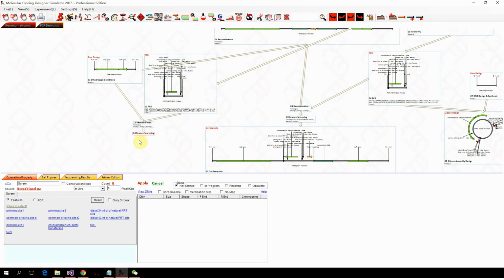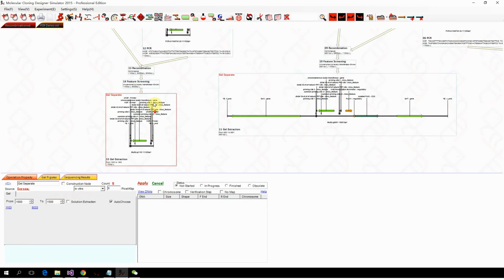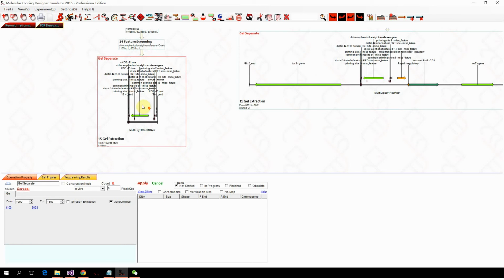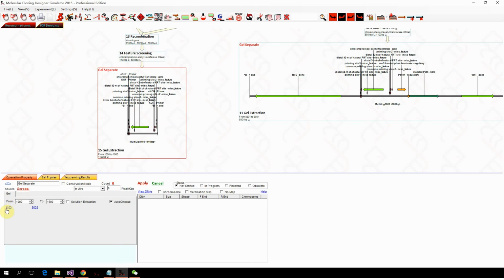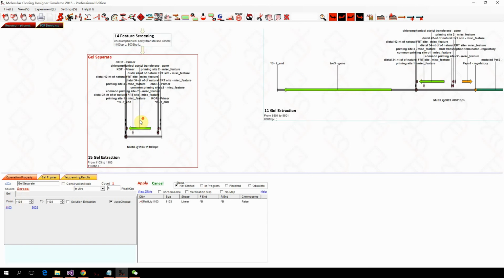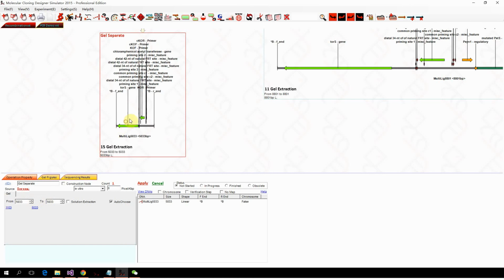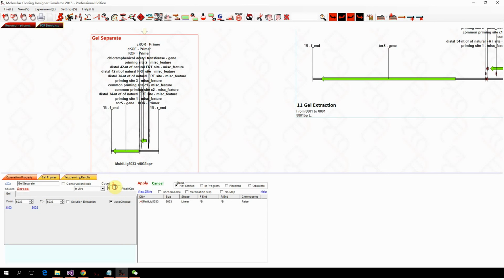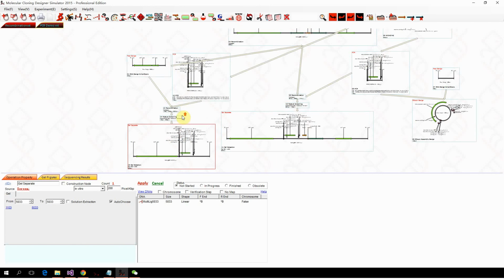So we want to find the one with chloramphenicol resistance here, and just use gel separation, because the gel separation can separate them by the length. The 1.1 kilobase pair one is still the fragments, and this one is the genome fragment replaced by chloramphenicol.